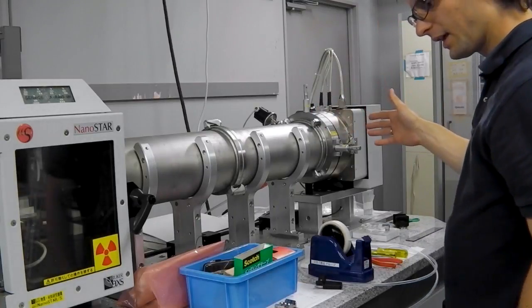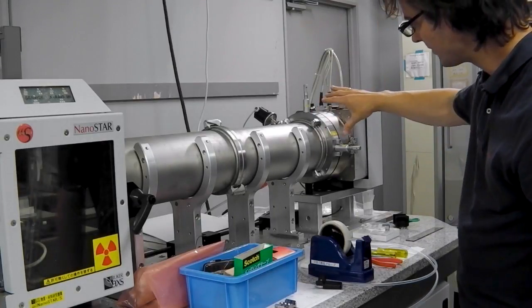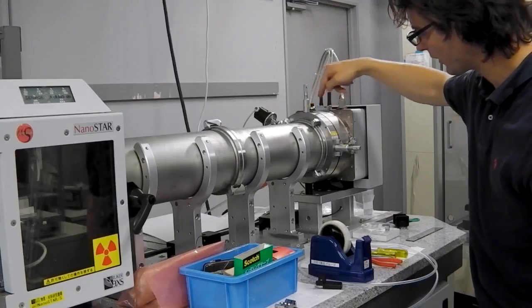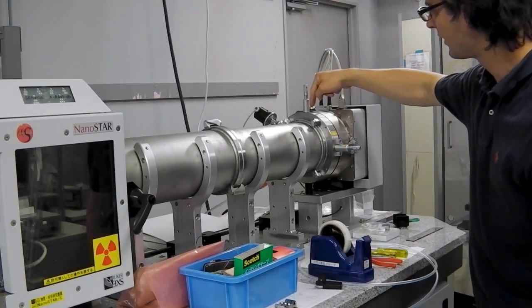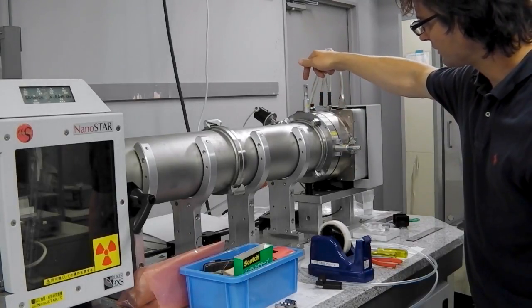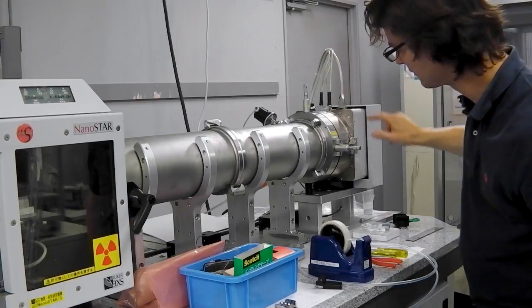At the very end of the flight tube, we have the beam stop. The beam stop sits over here. It's connected with wires and springs, and it can be adjusted, again, with these micrometers over here and here.